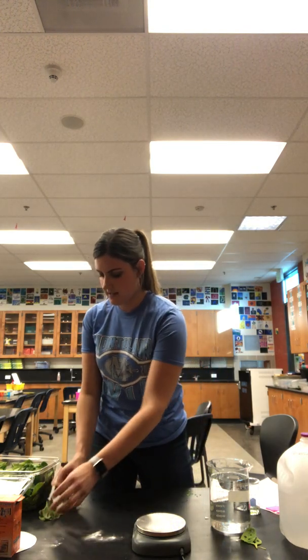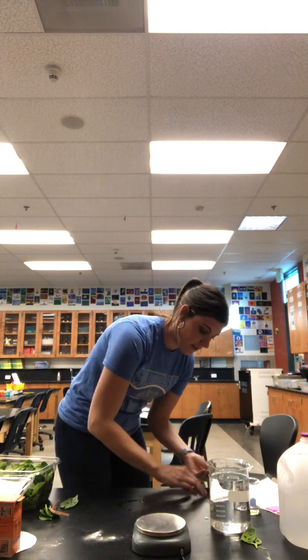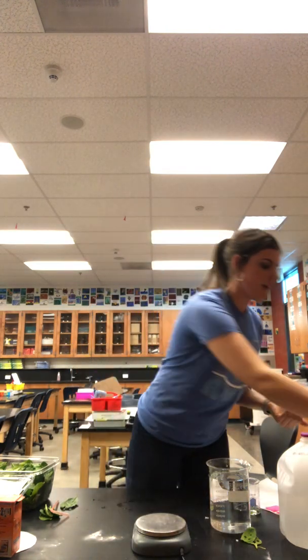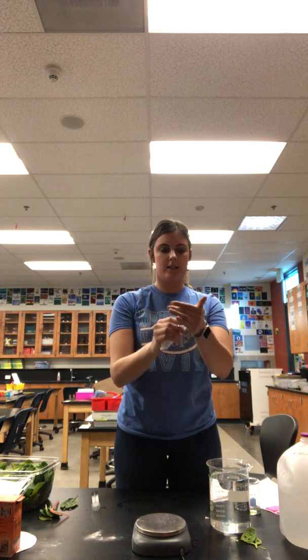Okay, so I have about 10. It does not need to be exact, just at least 10 or above, so that we're getting accurate data. Now that I have these leaf chads, I'm going to take my plastic syringe, remove the top, and dump those leaf chads in the syringe.